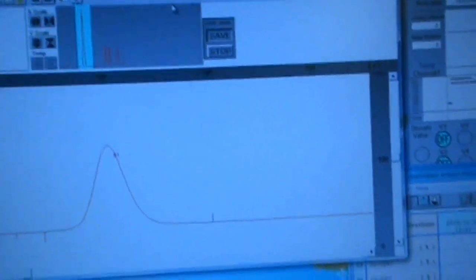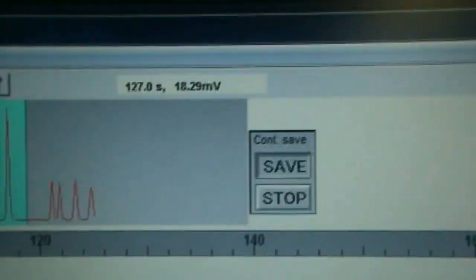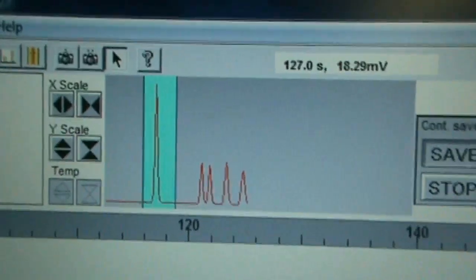Alright, do you see her? See? And now I want you to show me the peak on and off. And I'm assuming there should be another long one. We can look at the timing in a minute here. But you can see how our chromatogram is still going, but we're focused in on this one peak.